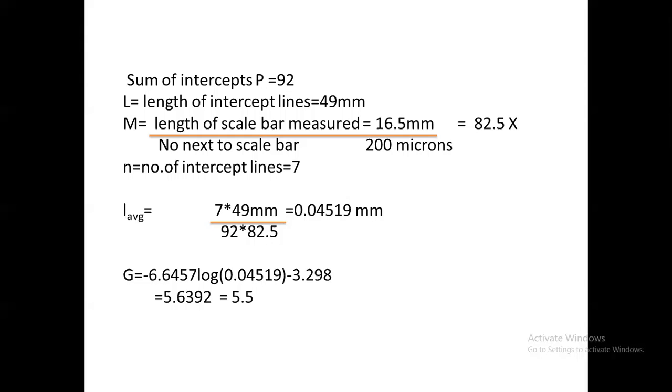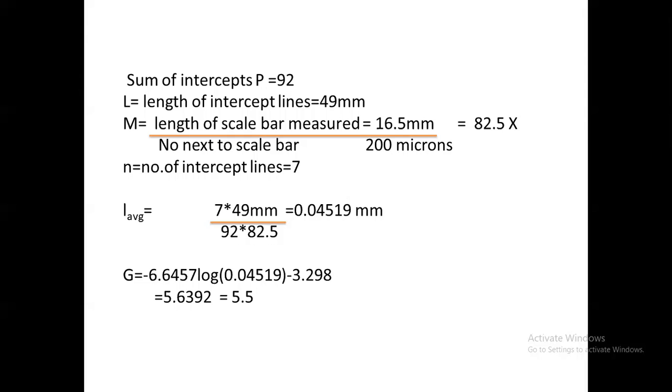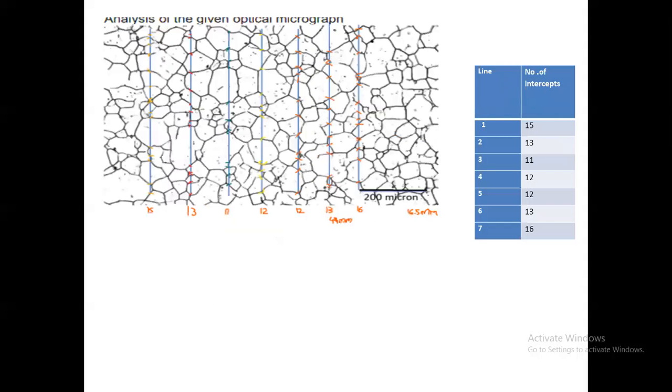So this is the procedure to find the average grain size of a given optical microscope image.